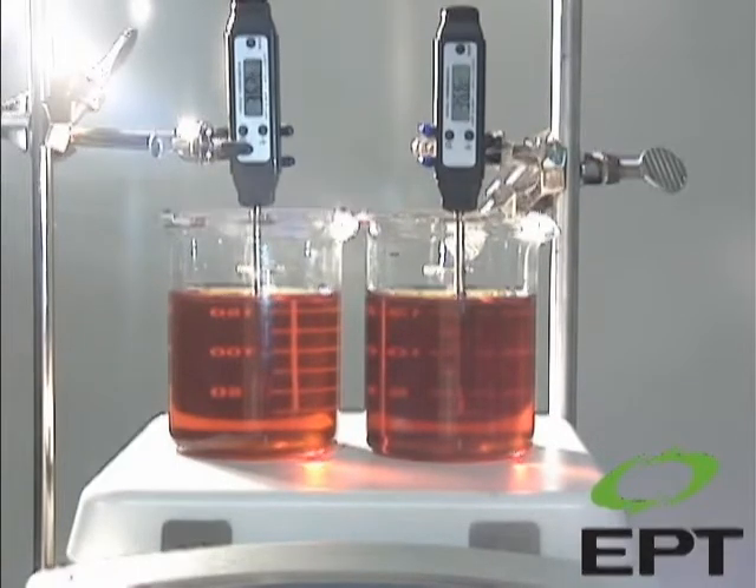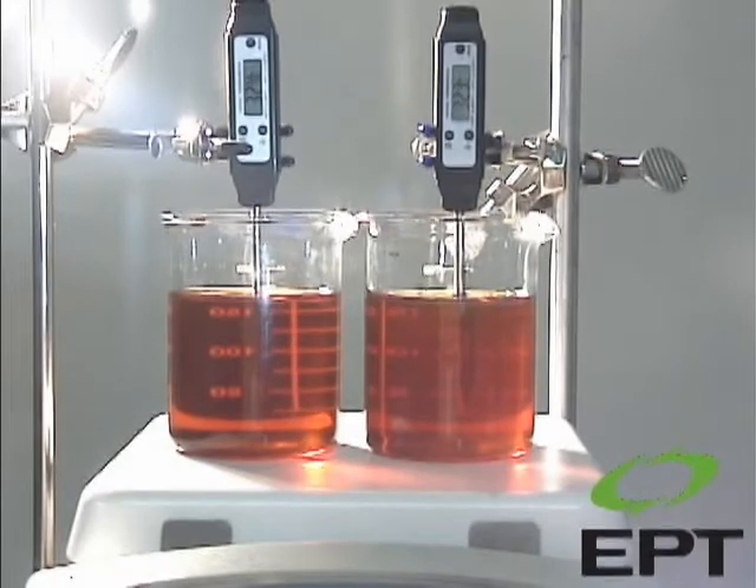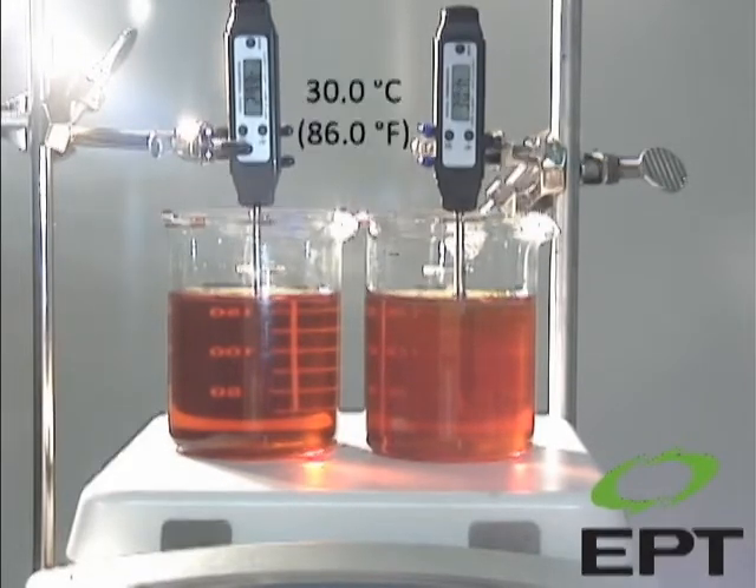As both samples start to cool, fluid solvency decreases, which reduces the fluid's capacity to hold oxidation byproducts. As this contamination falls out of solution, you can observe the varnish formation as the fluid is no longer translucent.